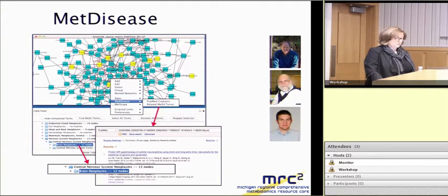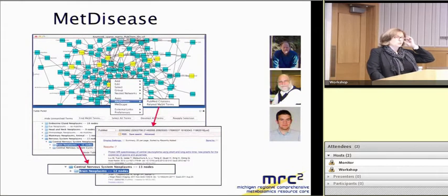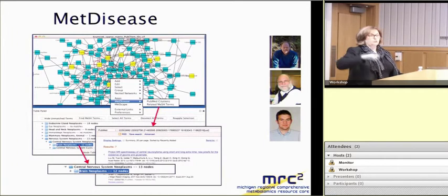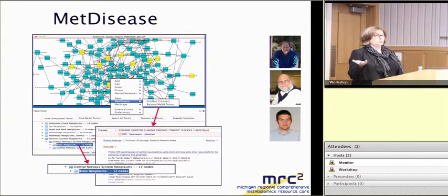Except that in this particular case, this published set of metabolites, what they did, instead of calculating simple Pearson correlation, they did something that is called partial correlation, which essentially allows you to take into account many additional variables. So it does not just calculate correlation between two metabolites, but it also takes into account the influence of other factors, okay? As long as you can express them numerically, it can be the influence of other metabolites, or the influence of other factors in your study.